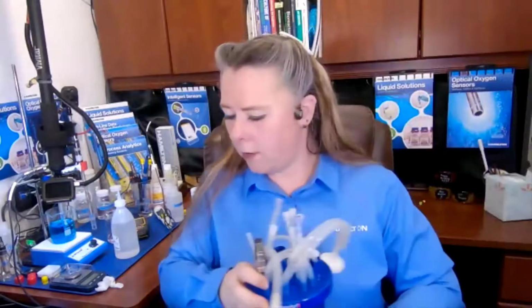And if your bioreactor is not large enough and you have to autoclave your sensors separate from your glass and then in a sterile hood put them together, well, once you add the media back in, you need to let your pH probes hang out in the media, re-wetting for 2 to 3 hours before you can get accurate, good, stable measurements.